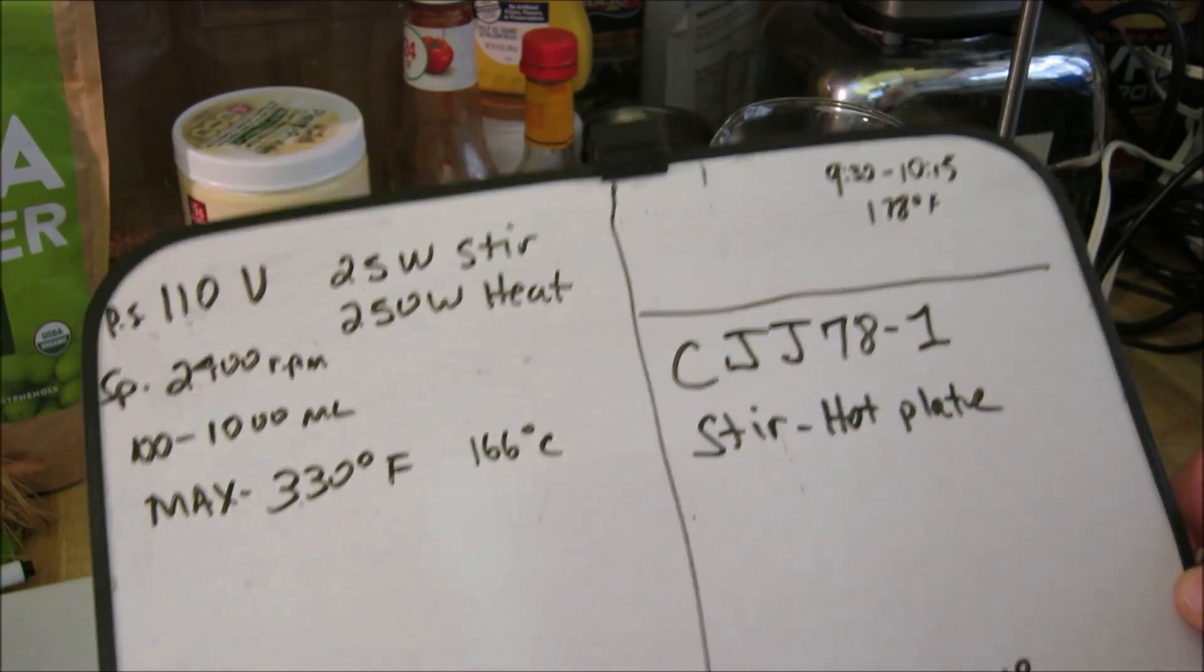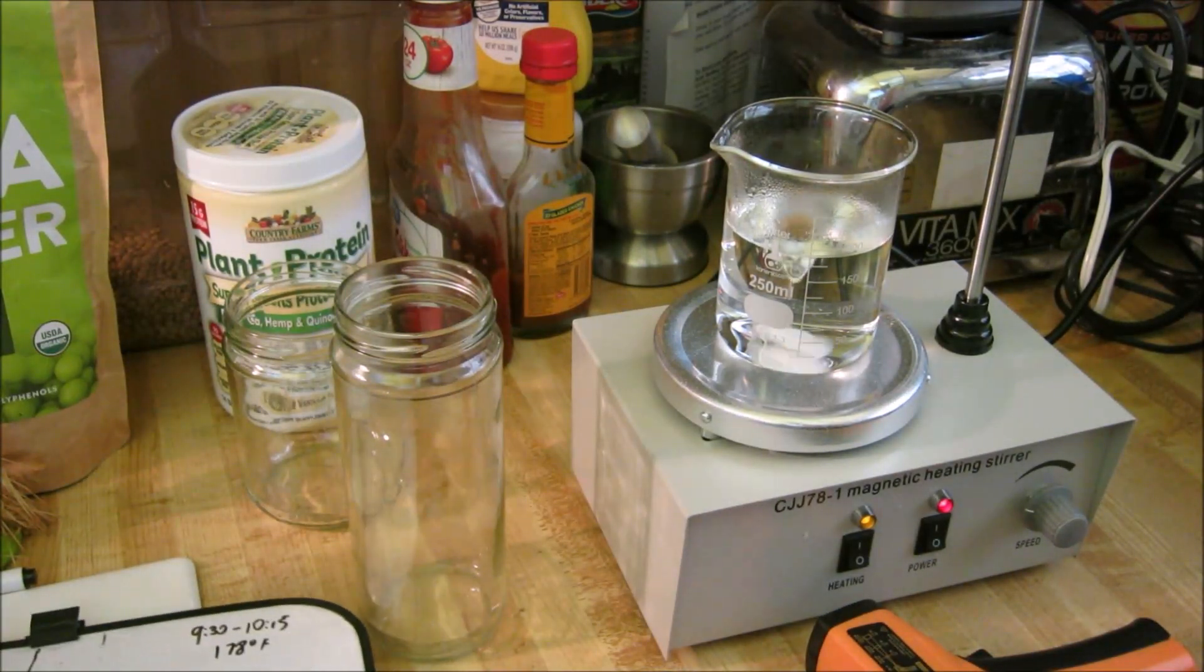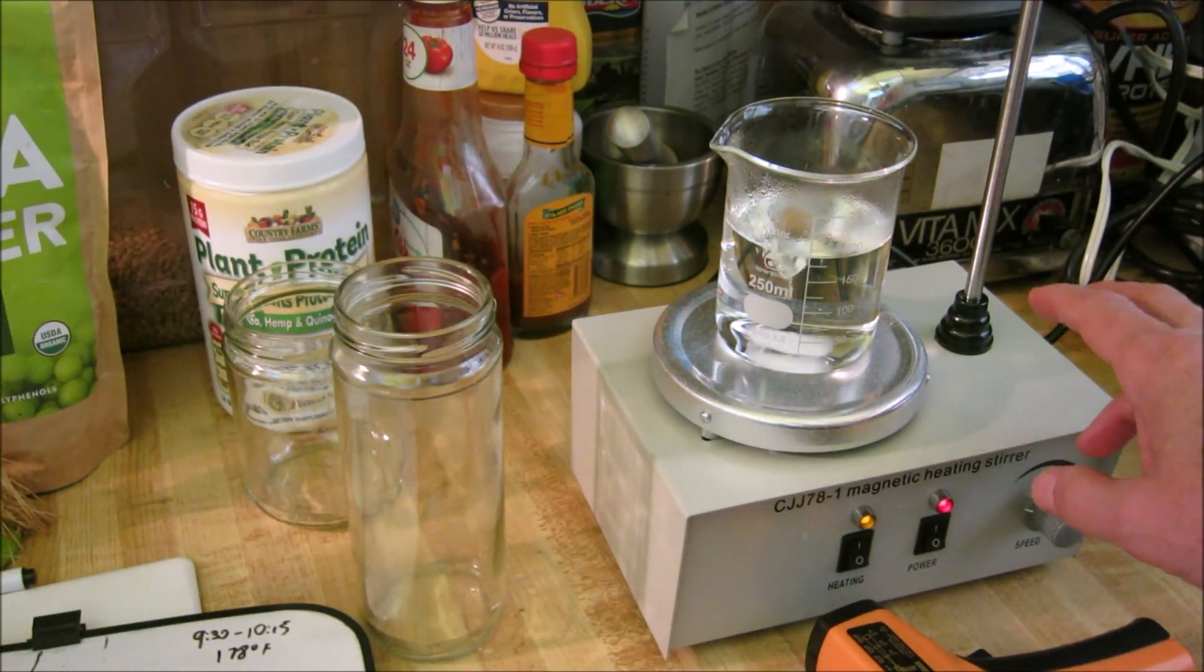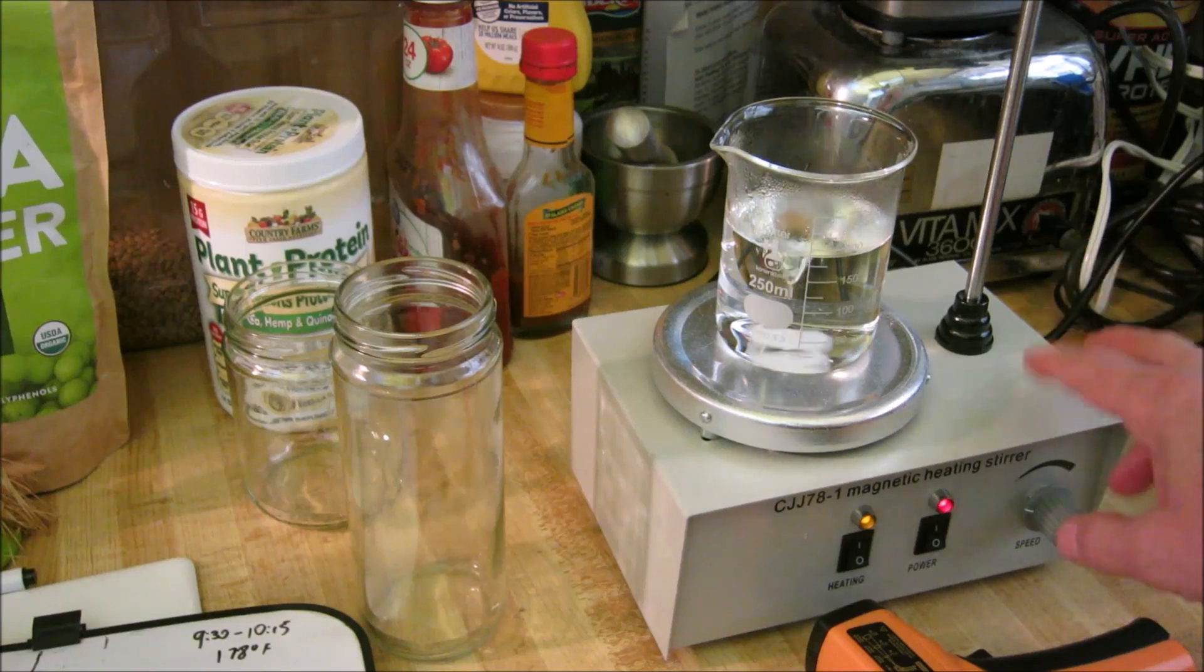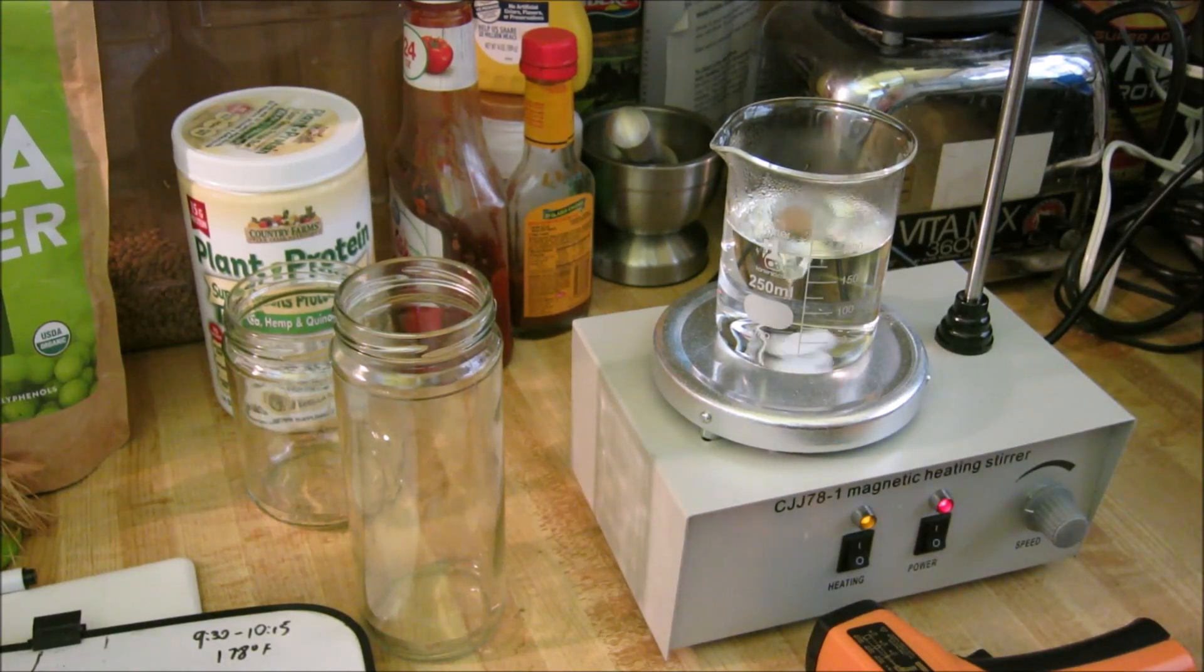So if you're interested and need a stir hot plate for any of your production, anything you're messing around with at home, you might want to look into this. It's not a bad unit.